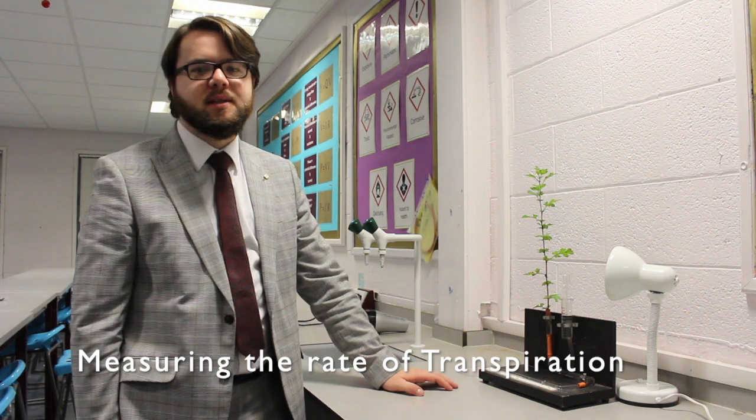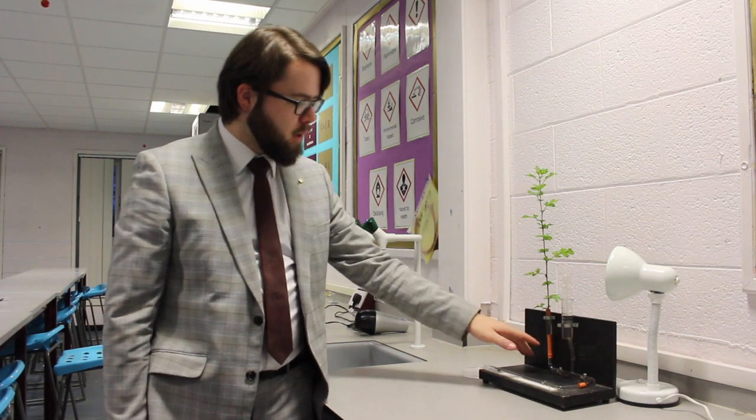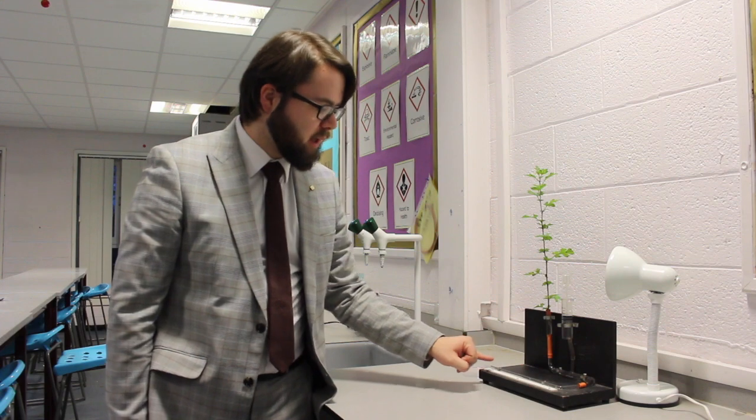Hi and welcome to this revision video on the potometer practical. A potometer is used to measure the rate of transpiration in a plant. Transpiration is the loss of water from the leaves. As the leaves lose water, the plant will replace that water with water from our reservoir, pulling it through the capillary tube. And we're going to change the environmental conditions to see how this affects the rate of transpiration.